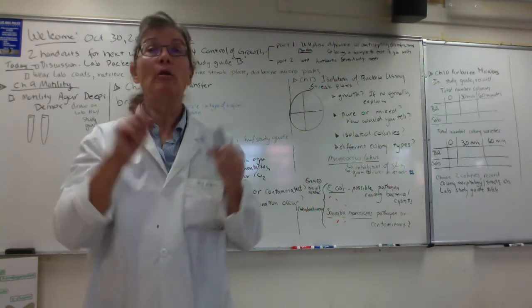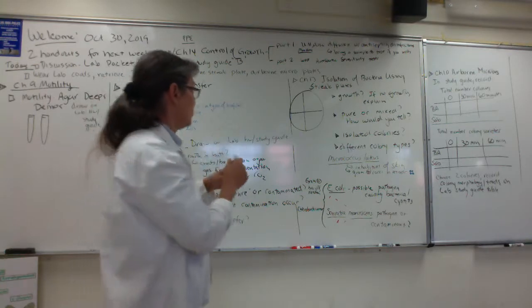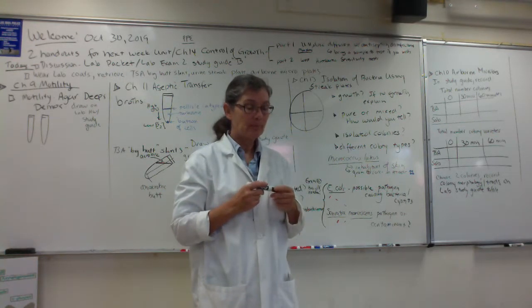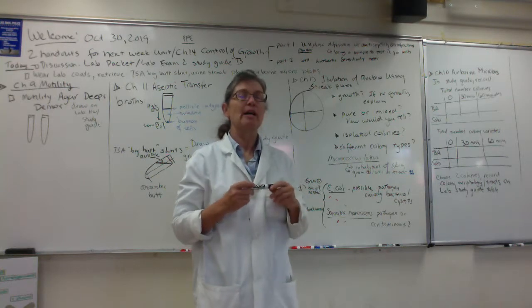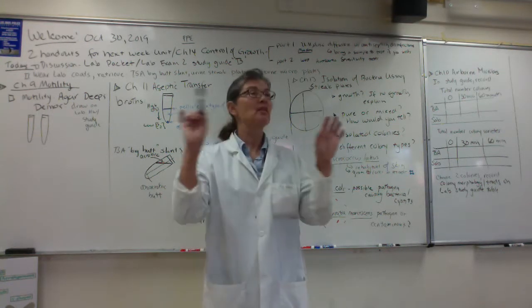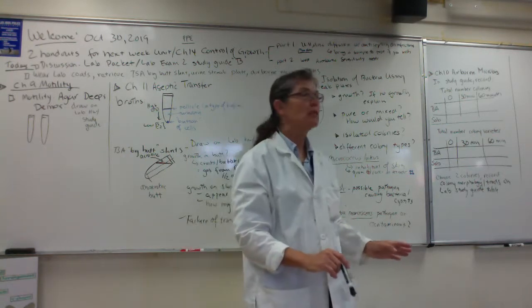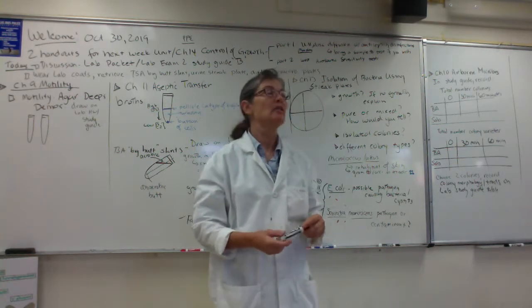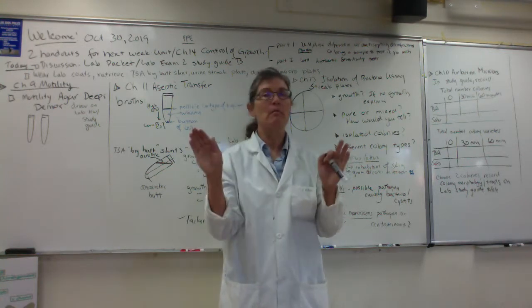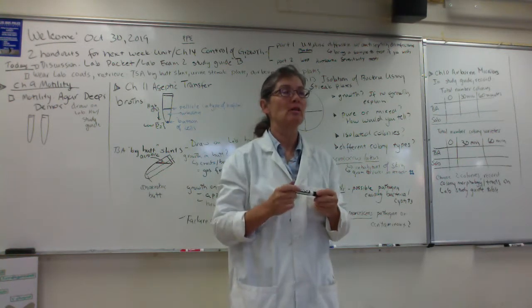all right? And what we would do, you guys, this is one of the points. So folks, we'll do a follow-up here. So folks, did you get isolated colonies? It doesn't matter where. Did you get isolated colonies somewhere on the plate? Then you succeeded, right? You guys, it doesn't matter where the isolated colonies are, right?